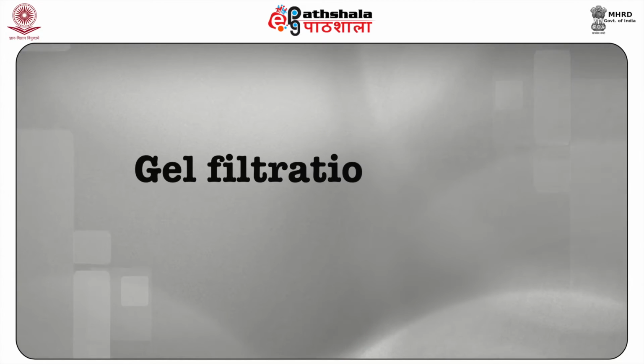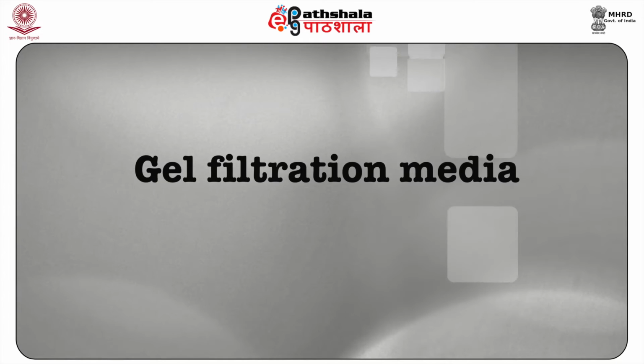Now students, let us discuss the topic of gel filtration media. The characteristics which are desired of the gel filtration media include number 1, chemical inertness of gel matrix. That means that the gel media should not interact with any of the compounds which are being separated. Second is the low content of ionic group. Third is the uniform pore and particle size. And fourth is the wide choice of gel particle and pore size. Fifth and the last one is high mechanical rigidity.